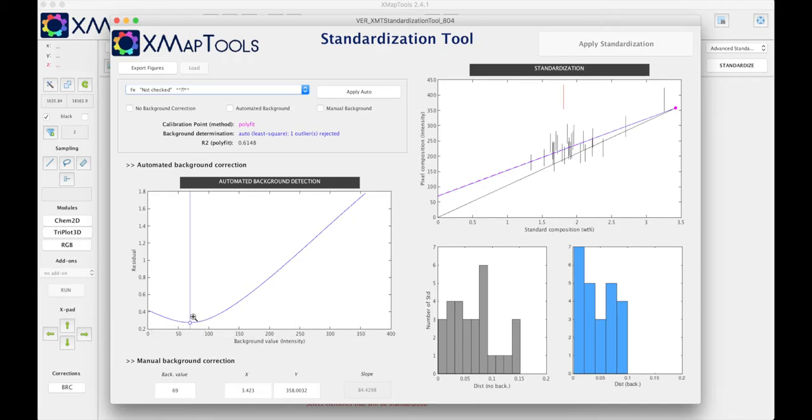It can help you to define where is the optimal background value. Those two diagrams show the distribution of the residuals with the distance, so the distance to the points compared to the number of standards.